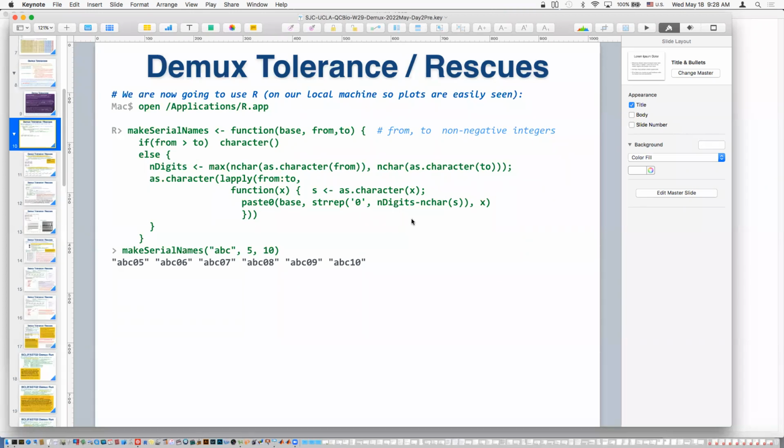And if you go too far out, like 3, 4, 5 mismatches, well, maybe 3 has something to it. But by the time you get to 5 mismatches, the marginal benefit you're pushing out is probably a very small recovery benefit, because almost all the sequences you're adding now are bad. So you're thinking more like 0 to 2 or something.